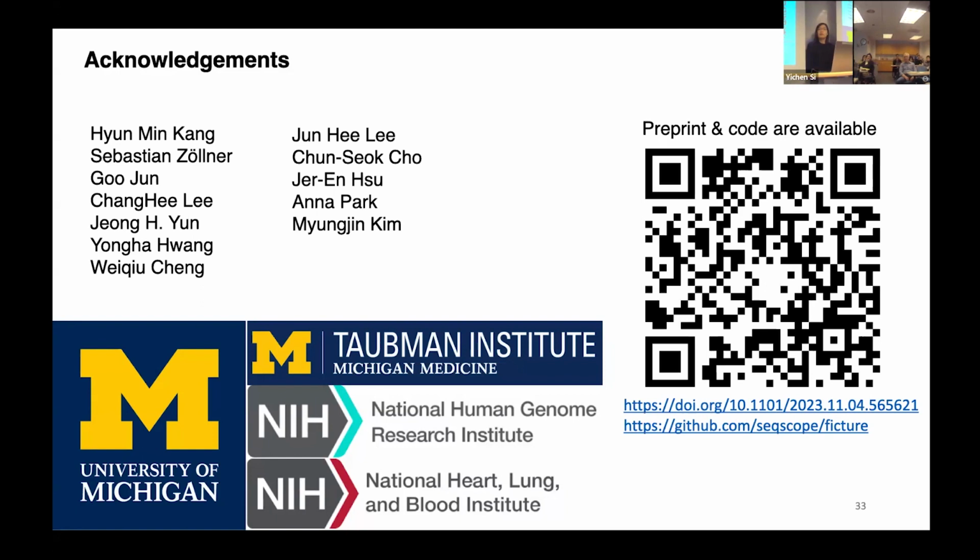Yeah, so I think technically it's possible. There are two important factors. One is the spatial resolution. The other is how much your transcripts diffuse during the whole process. If that level of diffusion is below the subcellular-level spatial pattern, then I think we could do it with this data. The other constraint is how many transcripts you can measure within the cell. With the continuous improvement of the technologies, we can certainly do that, but we haven't looked at that yet.